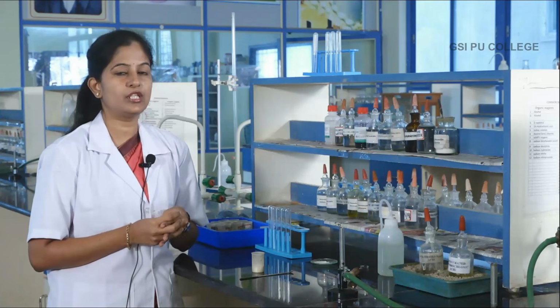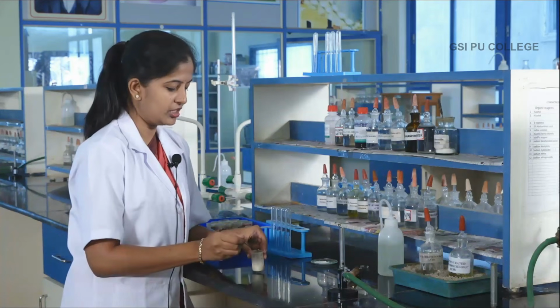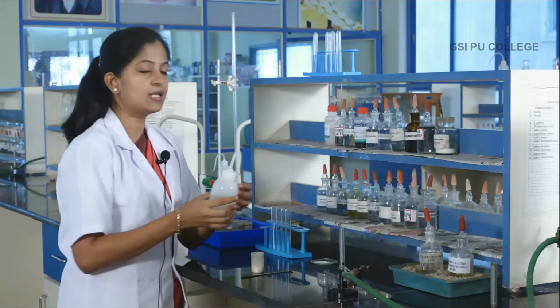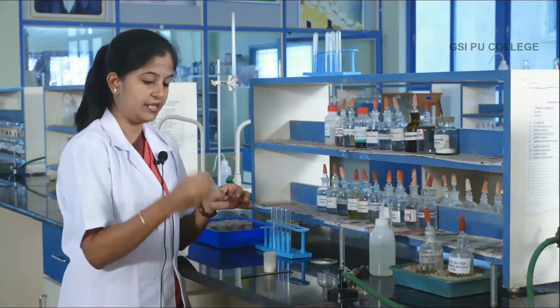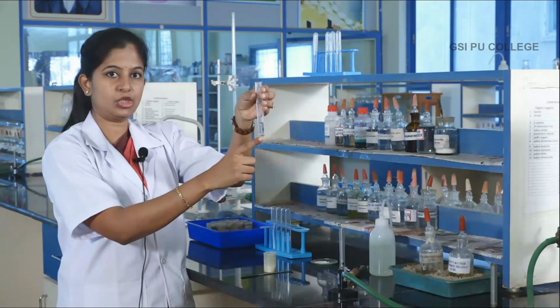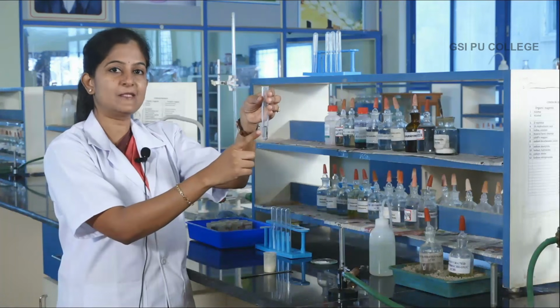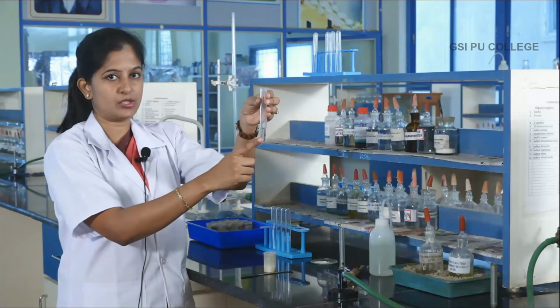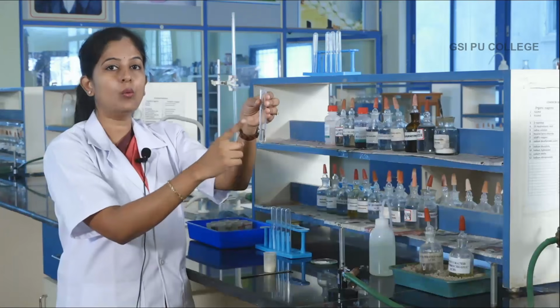Let us look into the solubility of the salt in water in cold condition. Take a test tube, a pinch of salt using your spatula, and add some plain water in cold condition. Mix it vigorously. You can observe that there is no salt remaining in the test tube, which means the given salt is soluble in plain cold water. So the preliminary examination is over.